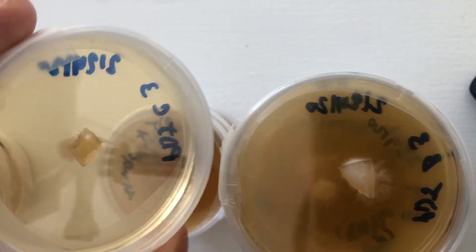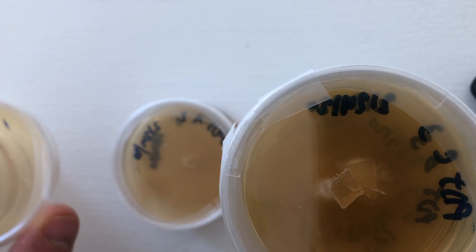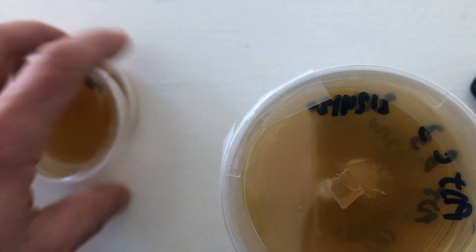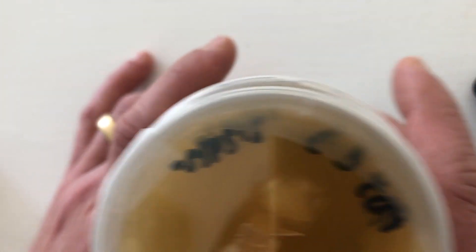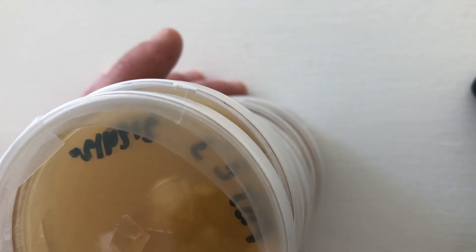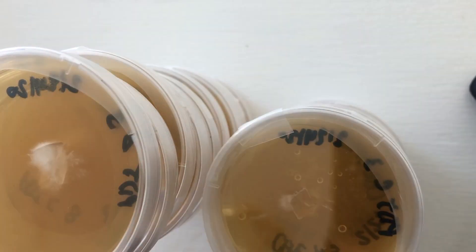Out of about 40 petri dishes initially — there's a good streak plate, there's another good streak plate isolate, that one's got some bacteria — so out of about 40 plates originally, I've got about 15 isolates that are clean for pink oyster, and probably another three that I can clean up.